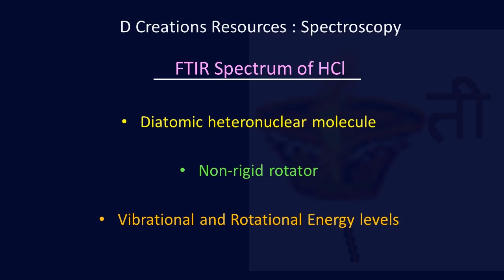As mentioned earlier, in case of HCl, the simple physical model is that of the atoms which are considered to be points of mass held together by weightless elastic springs. Now, classical mechanics gives the corresponding vibrational equation of this molecule, and the solution is represented by a sinusoidal motion of two masses at a frequency determined by their masses and the restoring force of the spring. Although the potential and the kinetic energy of the system continually interconvert during the vibration, the sum of both energies, of course, is kept constant, just like a pendulum.